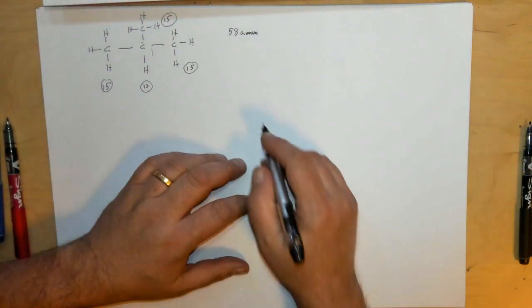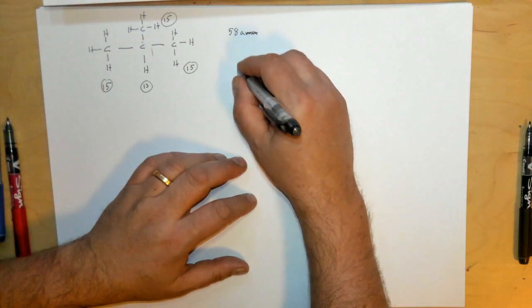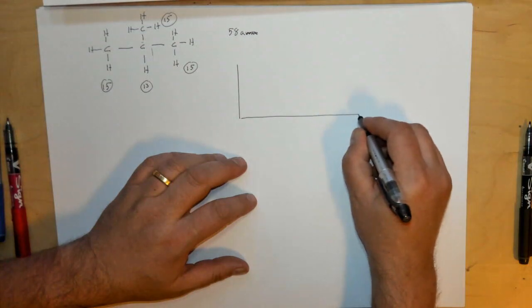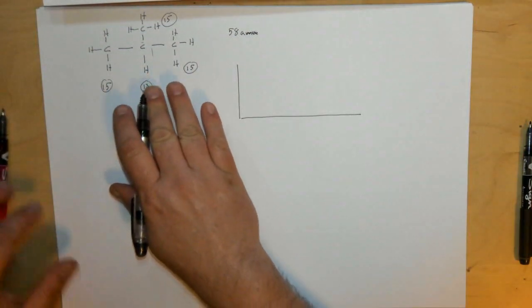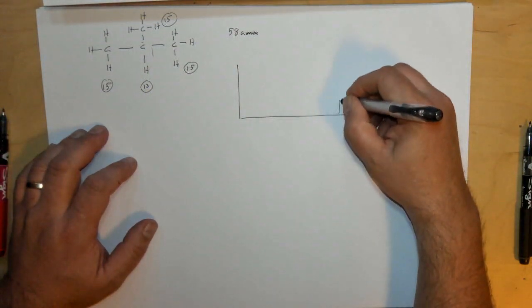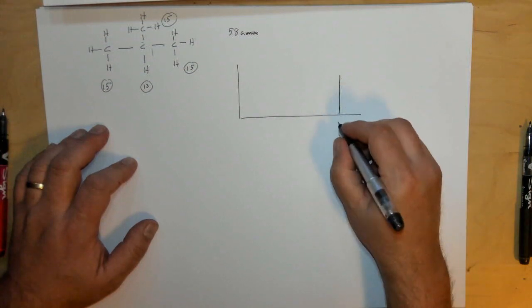So if we were to look at this, and we're sort of backwards engineering this mass spec diagram, we could see that if everything was working the way it's supposed to, and we're going to ignore isotopes in this case, then you'll get a peak at 58.